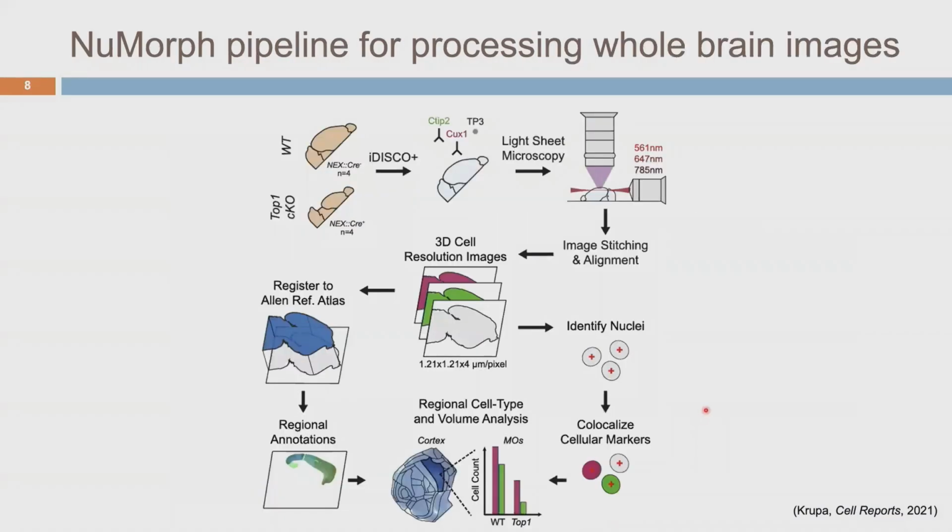So as all the neuroimagers at this conference know, analysis of images requires a detailed processing pipeline. A graduate student in my lab, Oleg Krupa, who recently graduated, developed a new pipeline for generating and analyzing these images on a commercially available light sheet microscope.